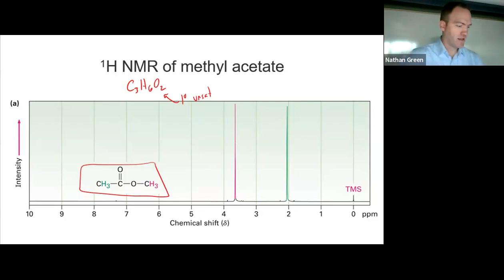Now notice that there's 3 protons here, but I only drew 1 spike. There's 3 protons here, but there's only 1 spike. NMR is a relatively slow technique. It measures over seconds. These 3 protons are spinning around on the femtosecond time scale. So in the time that it takes me to snap, that molecule has rotated about 11 billion times. Very, very fast.